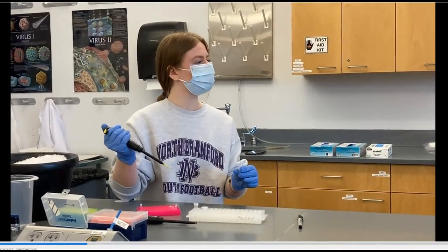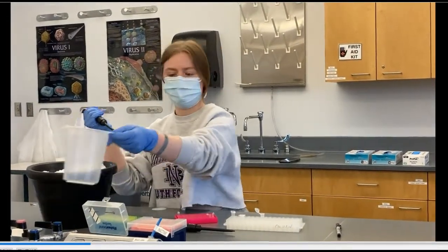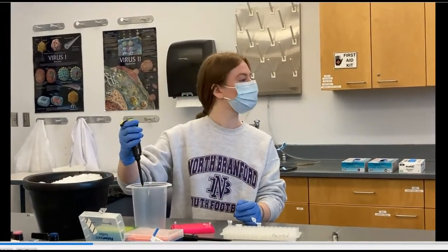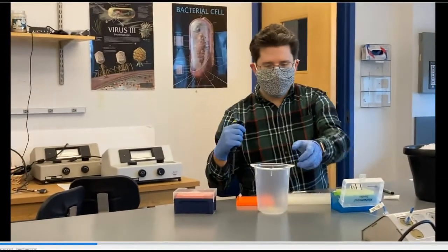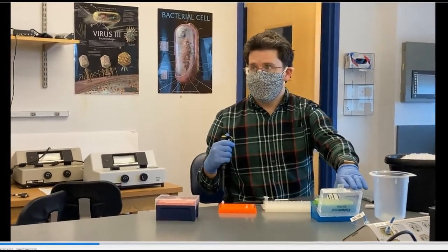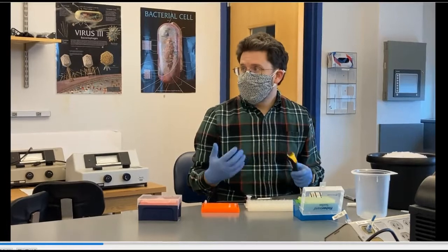When you're done, get rid of this tip because we're done with water. Go over your waste container, press down the ejector on the side, and it should eject. Now we're going to use the smaller pipetter to add the primers.